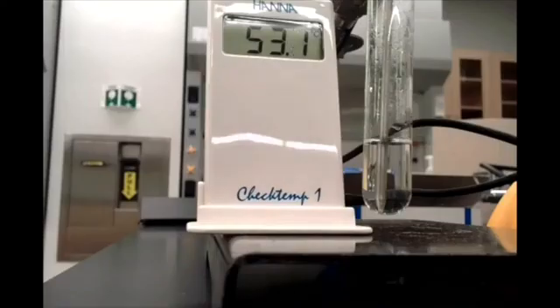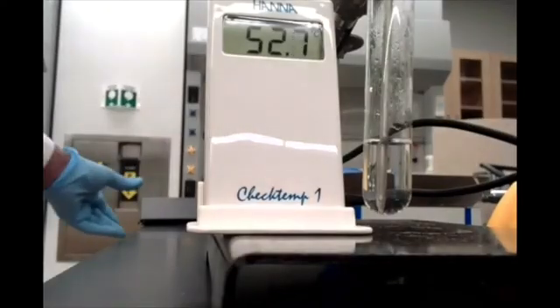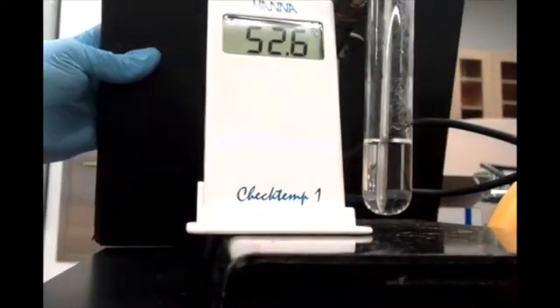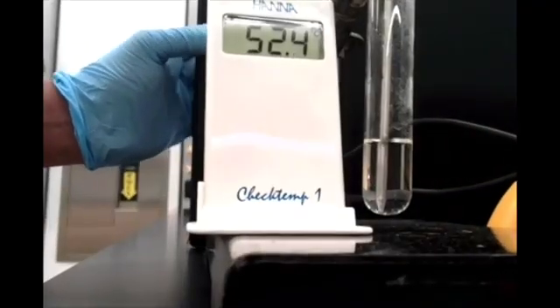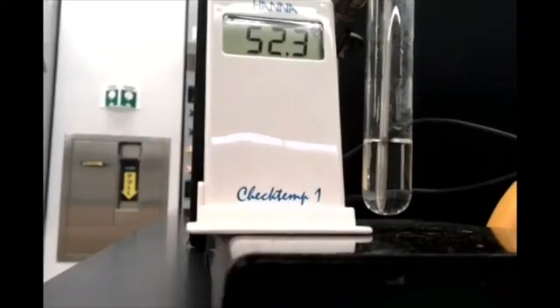So keep an eye on the test tube, especially down near the bottom, and see if you notice when crystals start appearing. I tried to set up a dark background there for you, so hopefully that will make it a little bit easier for you to see the appearance of any crystals.